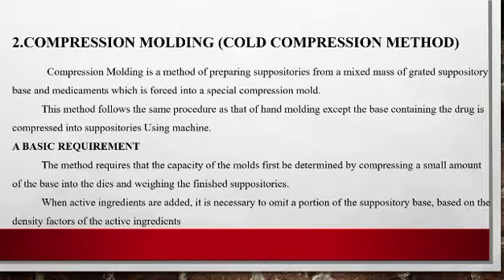The next method is compression molding, or the cold compression method. Compression molding is a method of preparing suppositories in which a mixed mass of grated suppository base and medicaments is forced into a special compression mold.